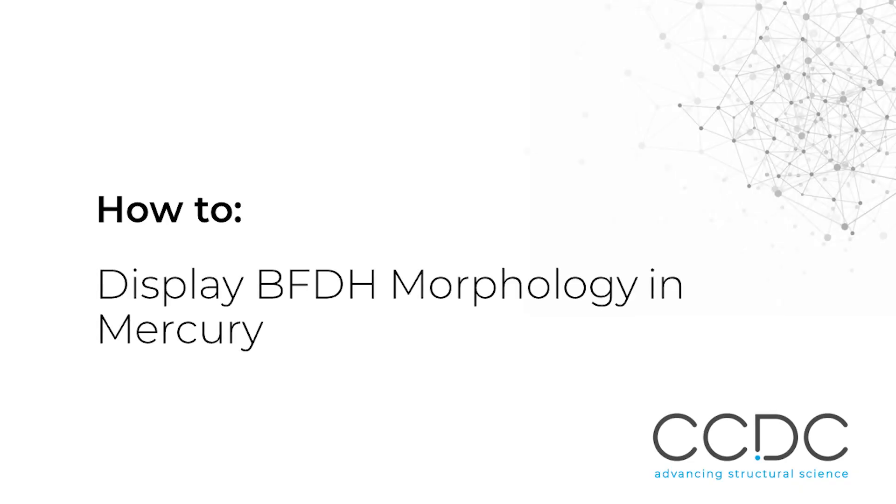Hello, I'm Ilaria Gimondi from CCDC and in this video I will show you how to use the BFDH morphology feature from the CSD materials in Mercury.